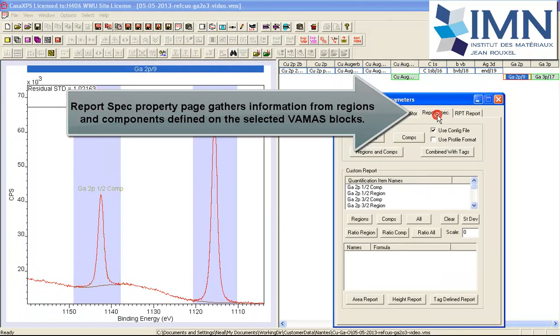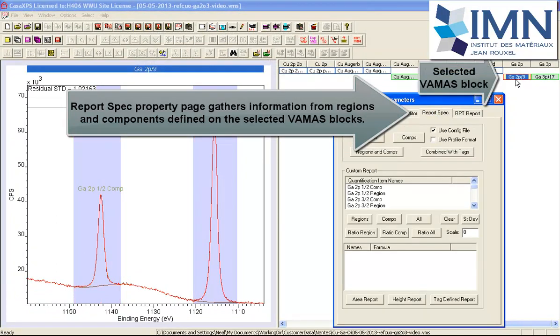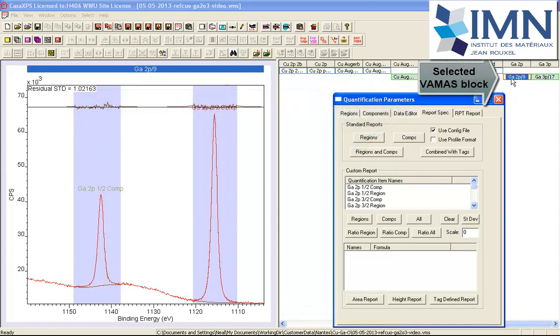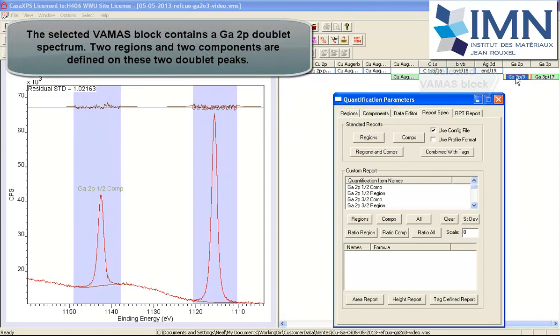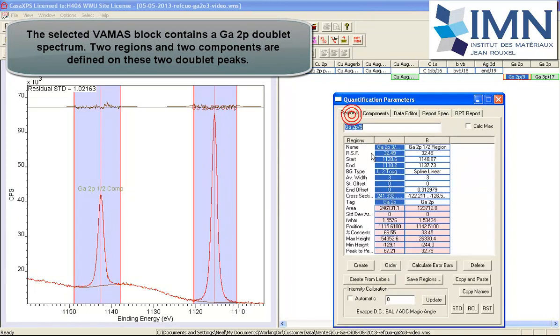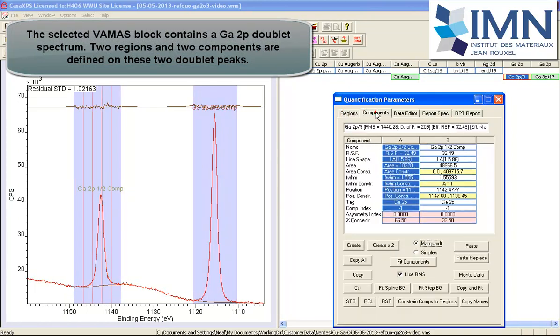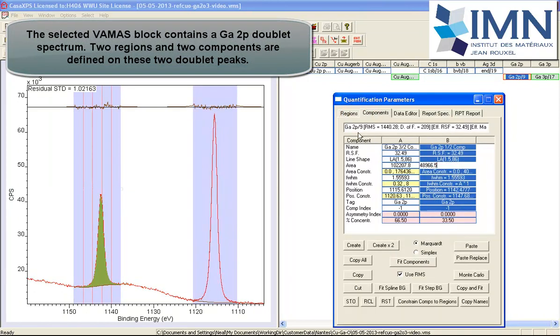The ReportSpec page makes use of VAMAS blocks that are selected. In this case I've got a Gallium 2P selected, and that's because I've got two peaks within this spectrum and I've defined two regions and two components.